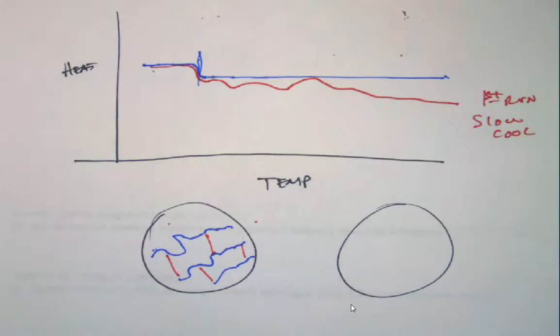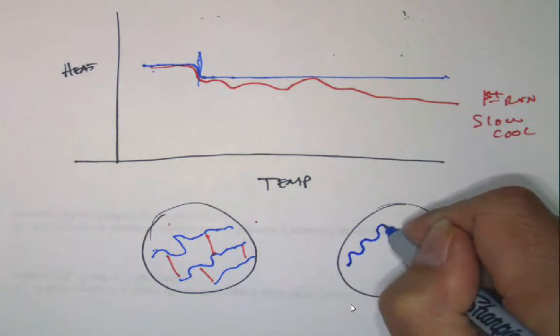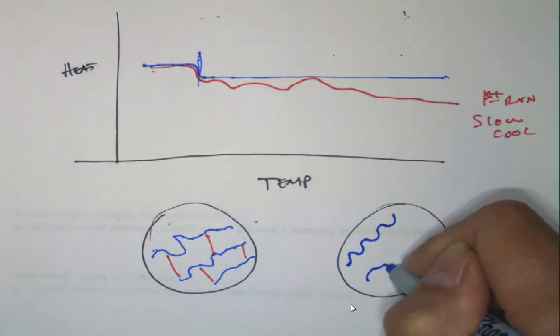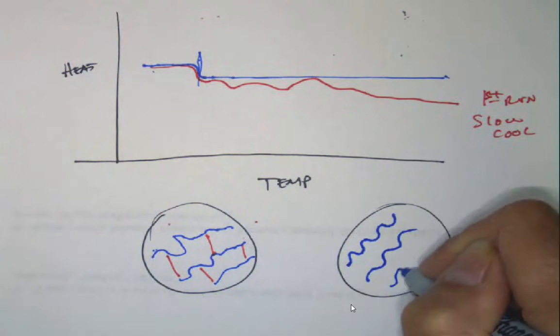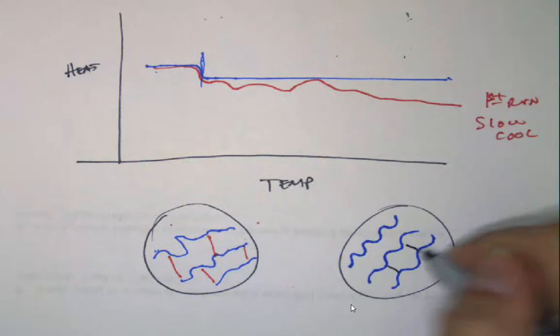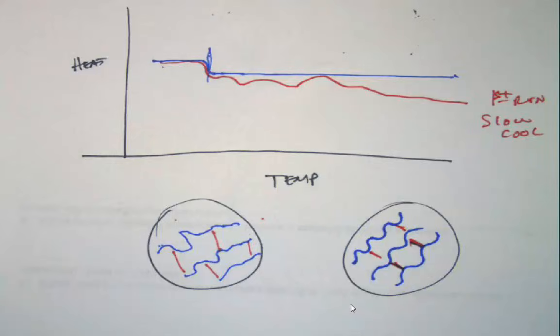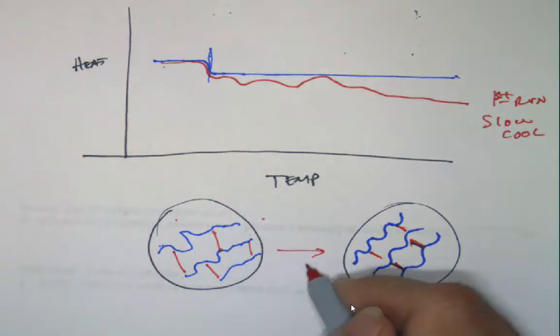There's some kind of connection in them, and the molecules are kind of stretched. Some of them are not in low energy conformations. By heating them up, we allow them to fold back on themselves a little bit. They're not going to crystallize. They can't do that. But they may assume a more regular kind of conformation, and the bond energies are minimized because they assume a low energy conformation.